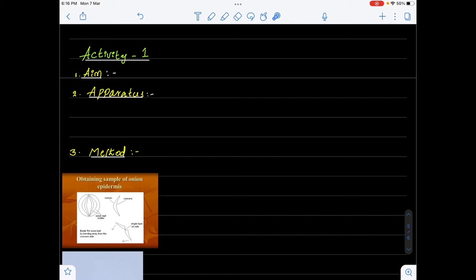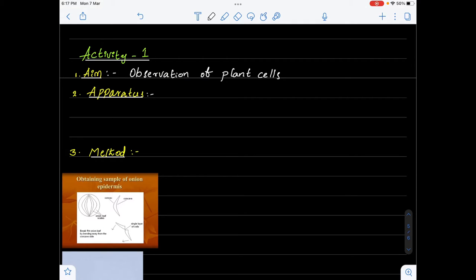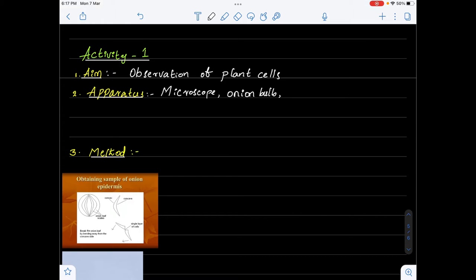In activity one, the aim is observation of plant cells. The apparatus or materials required to perform this activity are: a microscope, onion bulb, and watch glass.